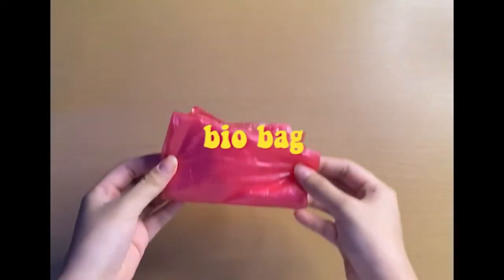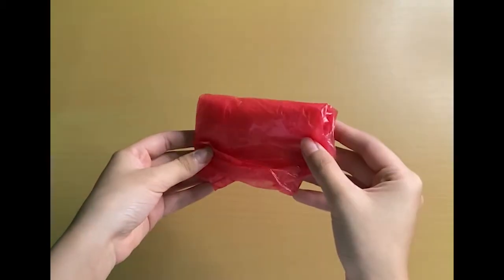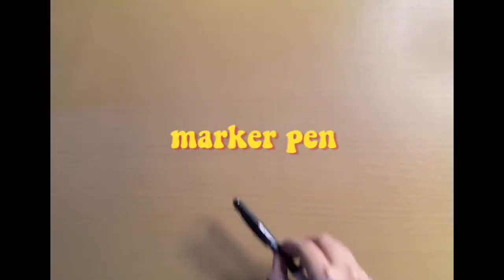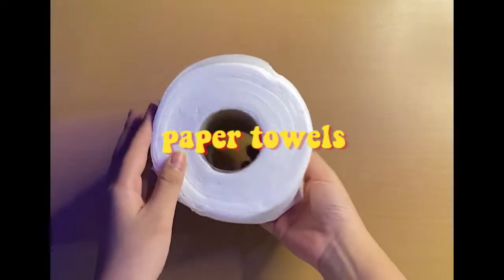Third, we have a biobag. This is where we will be disposing our wastes properly. Fourth, we need a marker pen to draw out our guides when making incisions on the frog's skin. Fifth, we also need paper towels to aid us in cleaning our workspace.